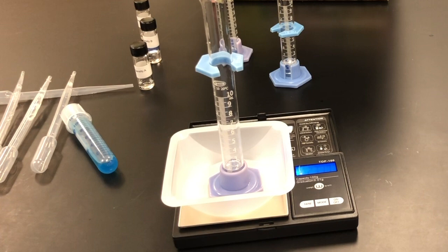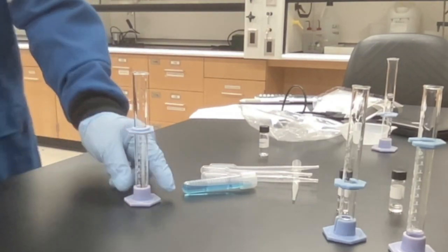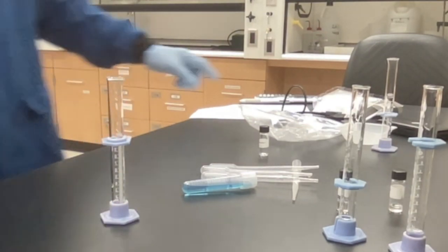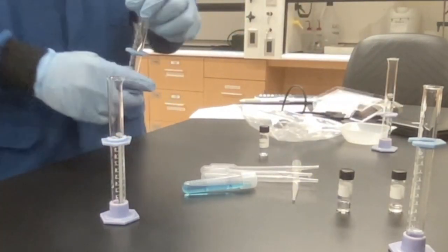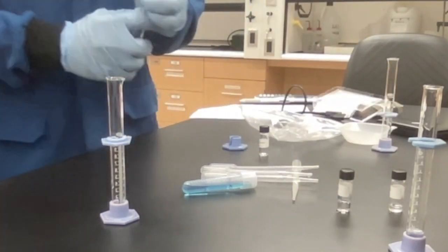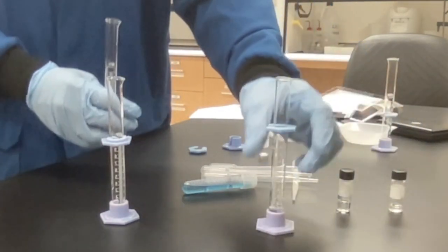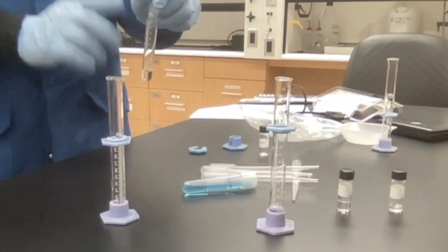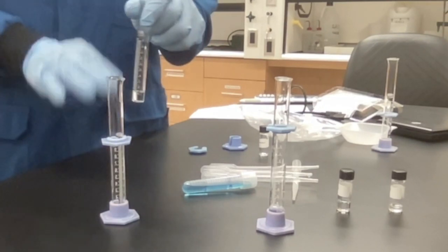So now that I have the mass, I can now read the volume of it. So the next step is to find your most dense liquid. You take that test tube. In this particular case, I'm just going to use the graduated cylinder, and then use that as a starting point. Okay, your most dense liquid should be at the bottom.